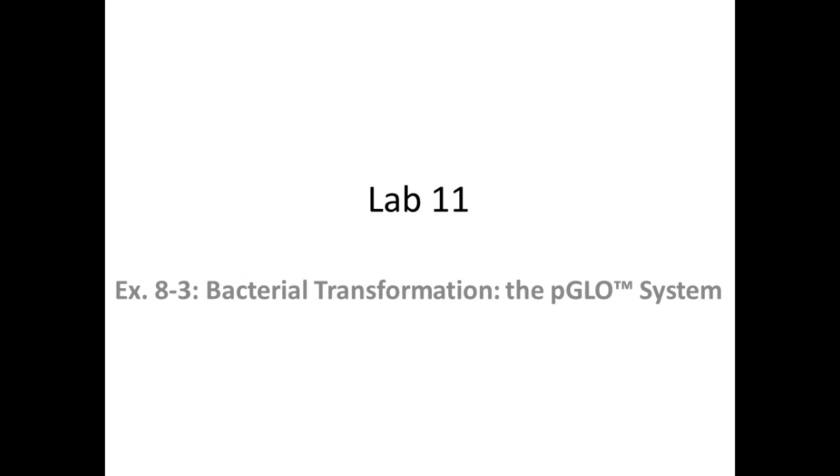So, as I said, this is a kit. It's called the P-Glow system. But what we're actually going to be doing today is bacterial transformations. Okay? So we're going to take bacteria and transform them to do something that they don't normally have the ability to do.